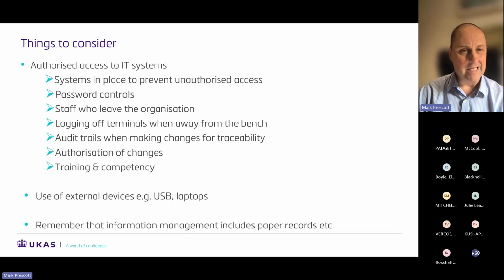Some of these may seem basic things, like logging off your terminals when you're away from the bench. I appreciate there's going to be a degree of pragmatism, where you might just walk away to get a reagent and then come back. But I frequently walk around labs and see unattended laptops, desktops and PCs turned on with nobody there, and when you ask where that person is, they've gone for lunch or something. So do bear that in mind. It's not unheard of for staff to start using other people's passwords to do things.